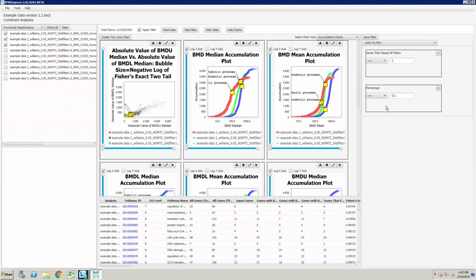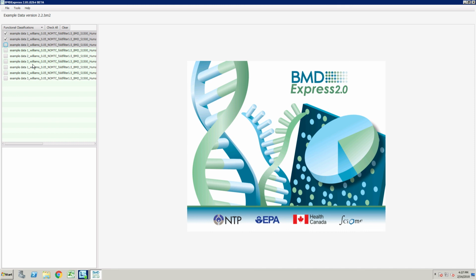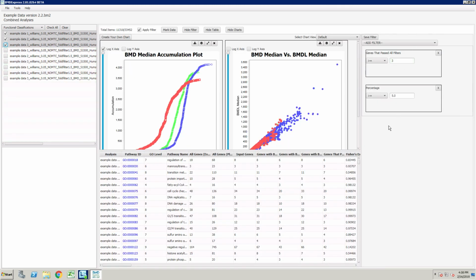One of the things we didn't note here on the filters is you can save the filter so it'll pop up again, just like in other places. And one of the other things is you can also shift click and export, or alternatively delete these items if you don't want them. This is true in all these sections here, you can check all or you can clear all. I'll give it a second to reload here, and yep, there's my saved filter. It came back up again.